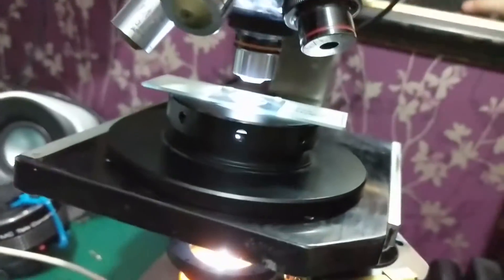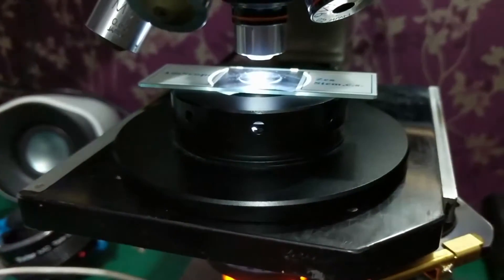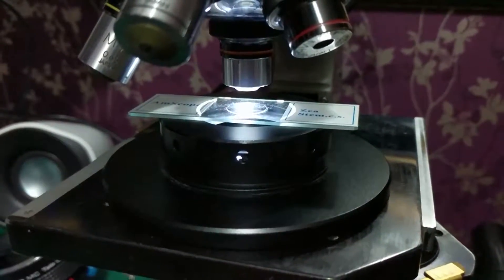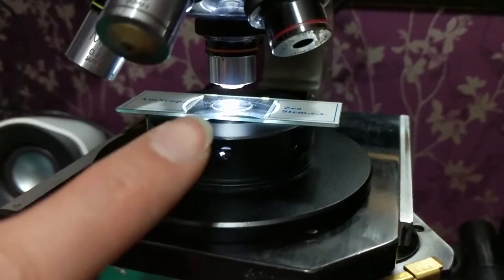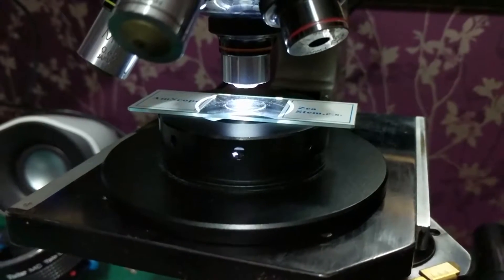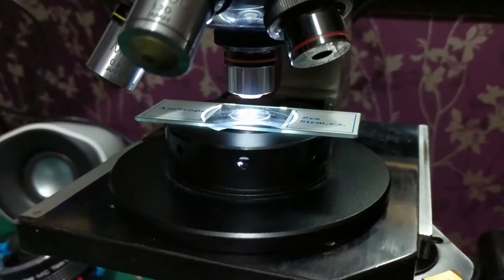But what I got in the post today is this thing, and it works via reflection without any lenses in it. It's actually quite effective and it's only about 30 quid or thereabouts on eBay, so if you want to get one, this is probably the cheapest way of doing it without bodging something up yourself.